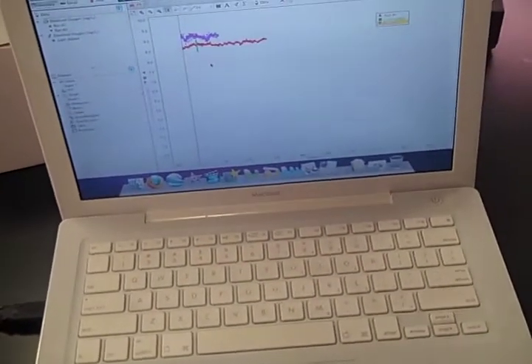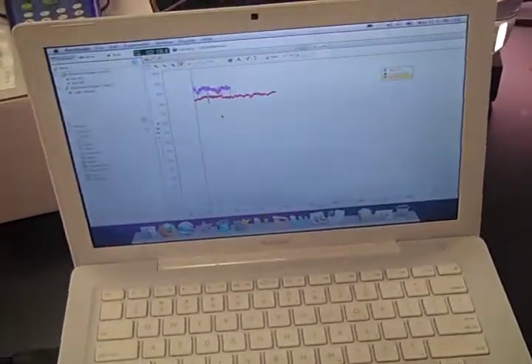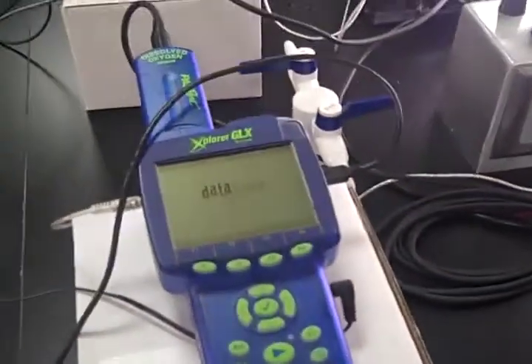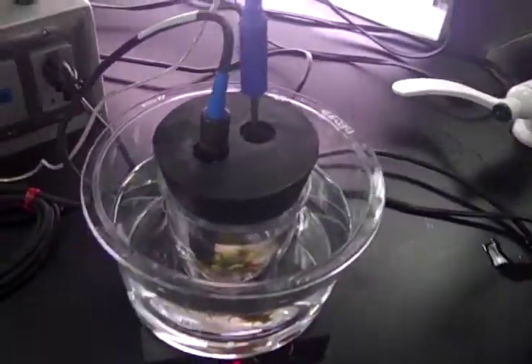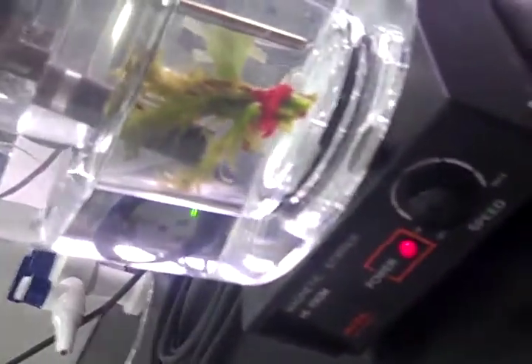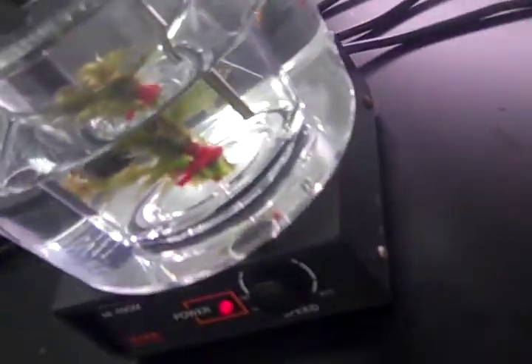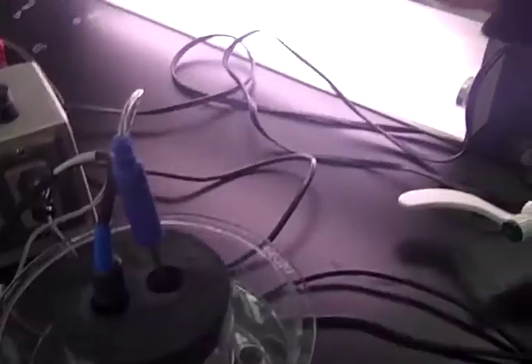Alright, this is our equipment for our photosynthesis lab. We first have the laptop, which helps show and display all of our data that we're collecting from the GLX. Attached to the GLX, we have all these cords running over to our temperature probe and our dissolved oxygen probe, and those sit inside of these two containers. The first container has water in it, and the second container also has water and elodia. The elodia is what's supposed to be producing oxygen, and we have the stir there to help with the reaction. We also have our light here, which helps with the reaction.